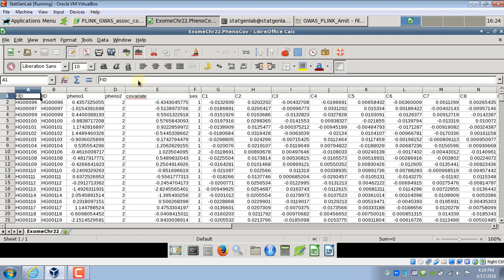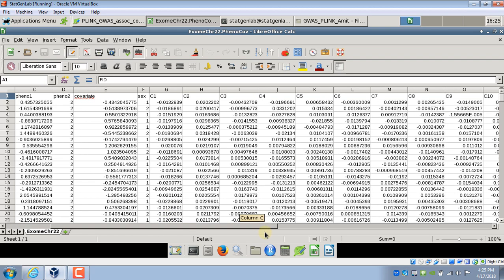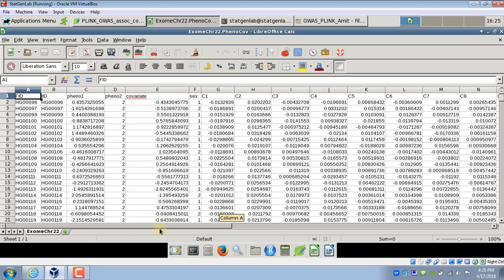Then you have headers for all those columns. In this particular case I have two phenotypes: one is a continuous one called pheno1, another is dichotomous called pheno2. And then I have a bunch of covariates. So there is first covariate called covariate and it's a continuous outcome. Second covariate I'm going to use is sex which is coded as 1 and 2. And then I have columns called c1 to c10 and these are principal components that we computed in our video about quality control using Plink.